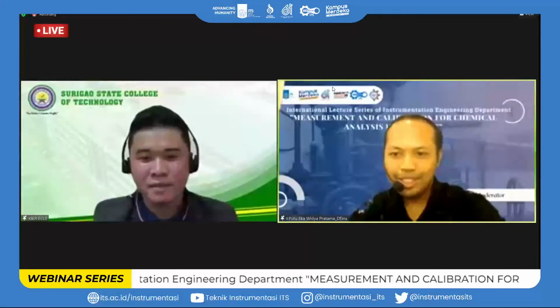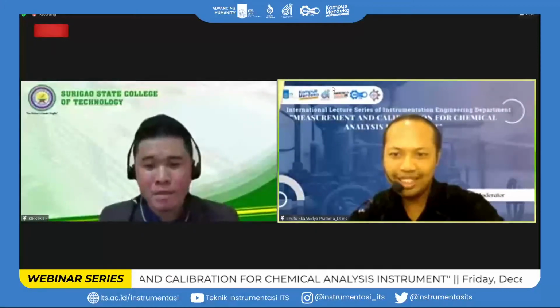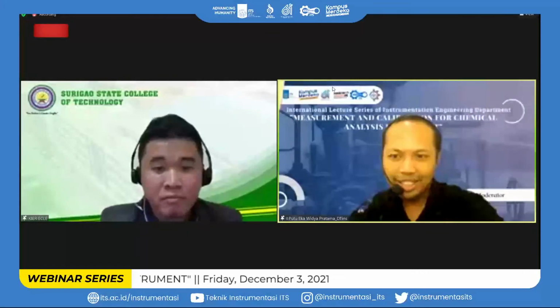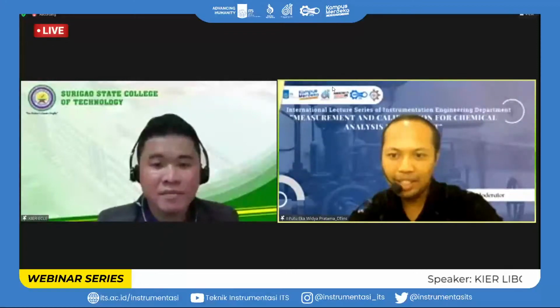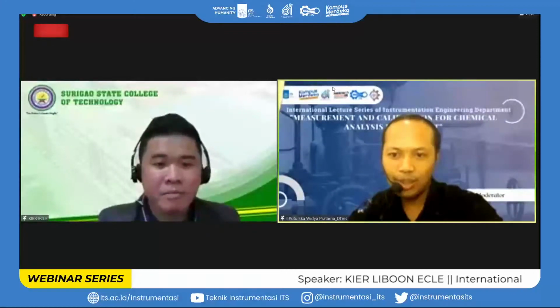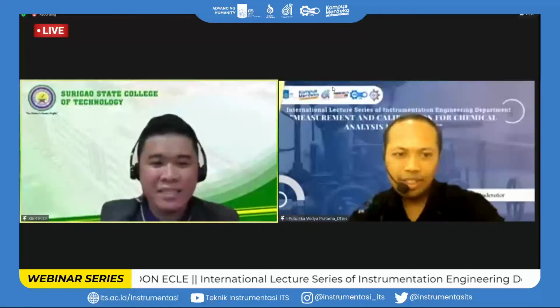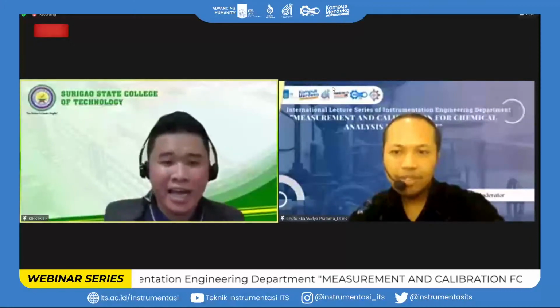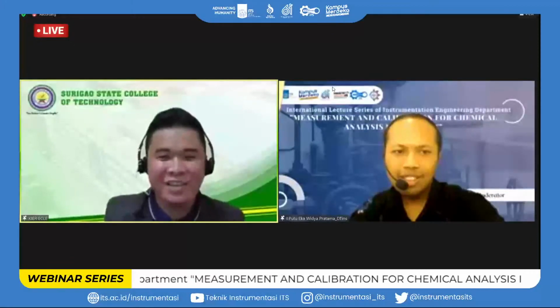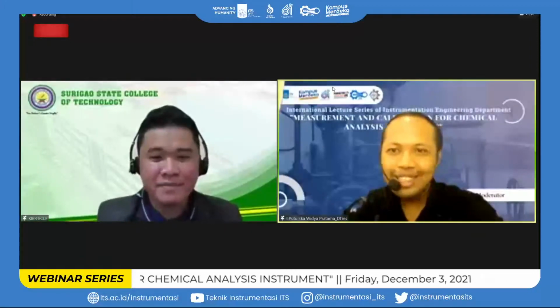Okay, so there is a second question also there. Is HCDP like that in the bottom of my chat room? Can you see, sir? Hydrocarbon dew point is also one of the applications of the spectroscopic method. I am not familiar, sir. Honestly, I am still not familiar with the hydrocarbon dew point. Whoever asked this, can you further elaborate what this HCDP is? Please.